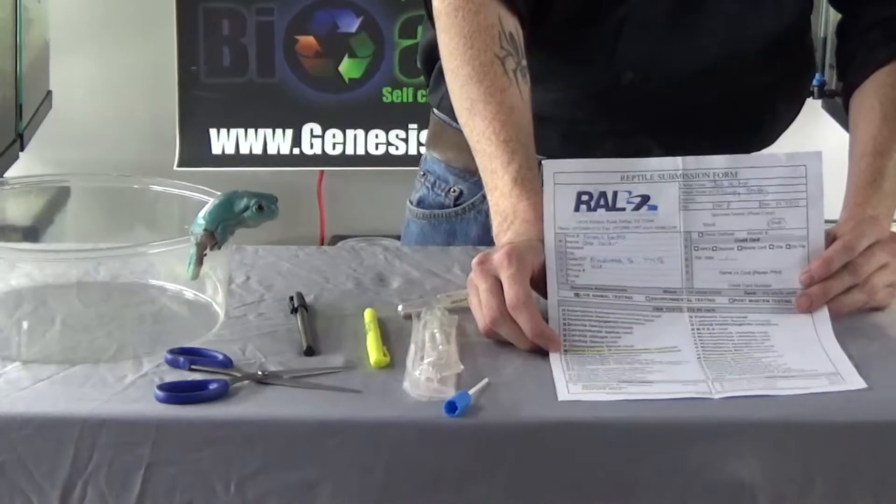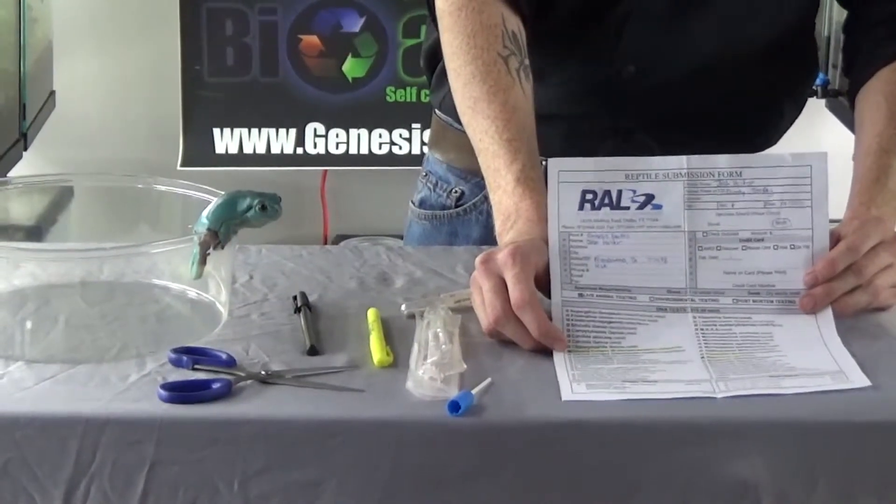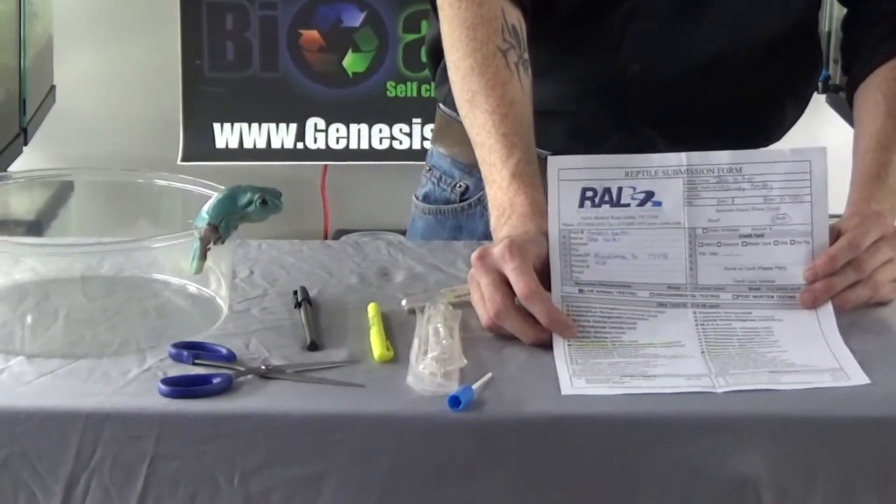If you are testing salamanders, this is the chytrid strain that you want to test for — not the B. dendrobatidis strain.